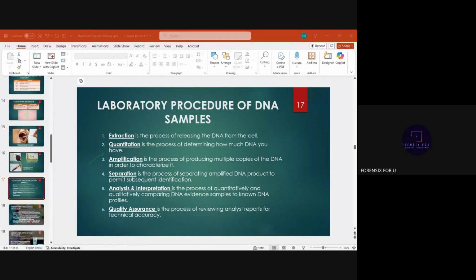Amplification of DNA: we need to increase the quantity of DNA to a detectable quantity. Every instrument has a detectable quantity below which it cannot give a signal or give you the result of the amount of markers that need to be amplified. So for that reason, we amplify the DNA that we receive from the scene of crime samples so that we get the appropriate DNA profile results further down the process.